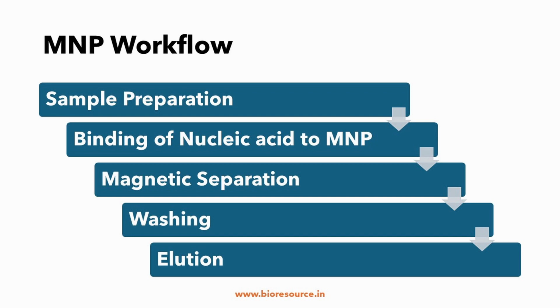For tissues, homogenization might be required to break down the tissue into a fine suspension. And biological fluids like blood or plasma might require centrifugation to remove the debris, or treatment with proteinase K as a pre-processing step before the lysis step, or along with the lysis we may have to use proteinase K in the workflow.